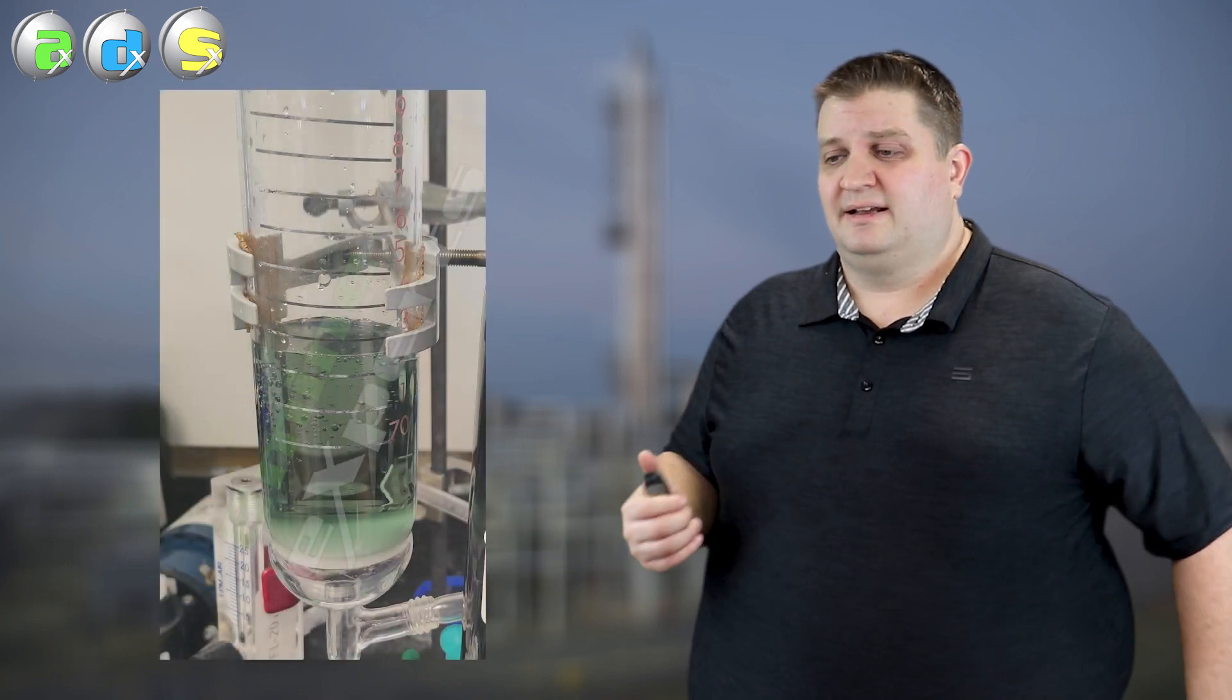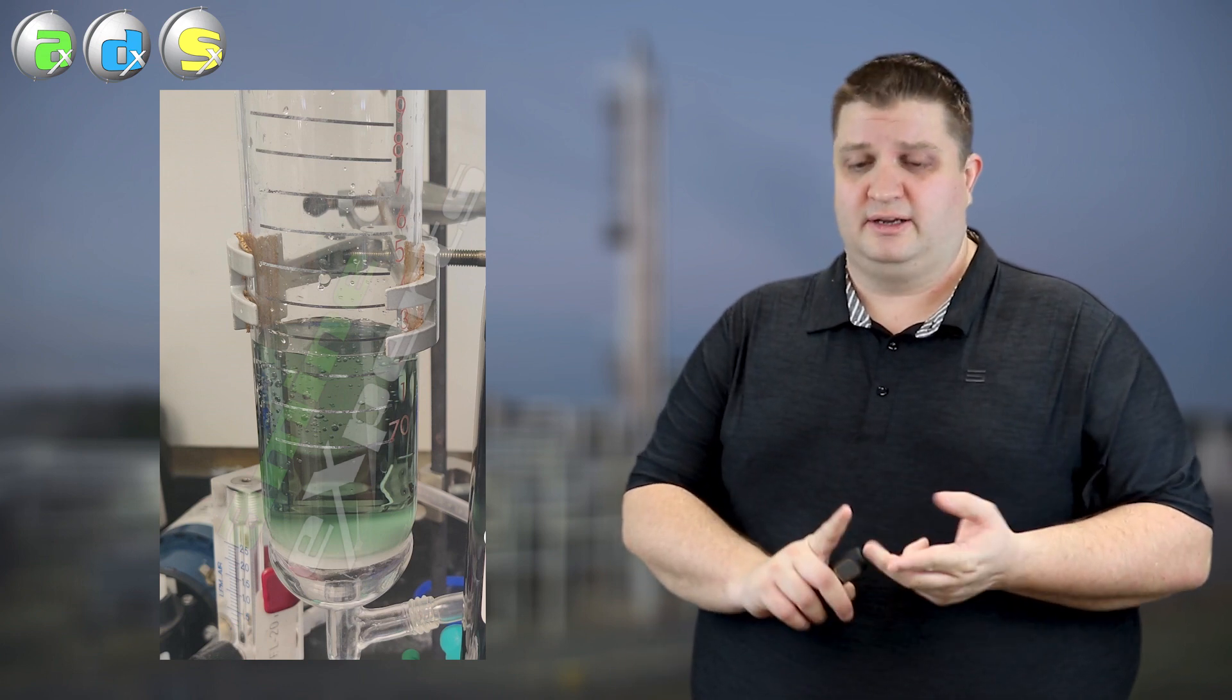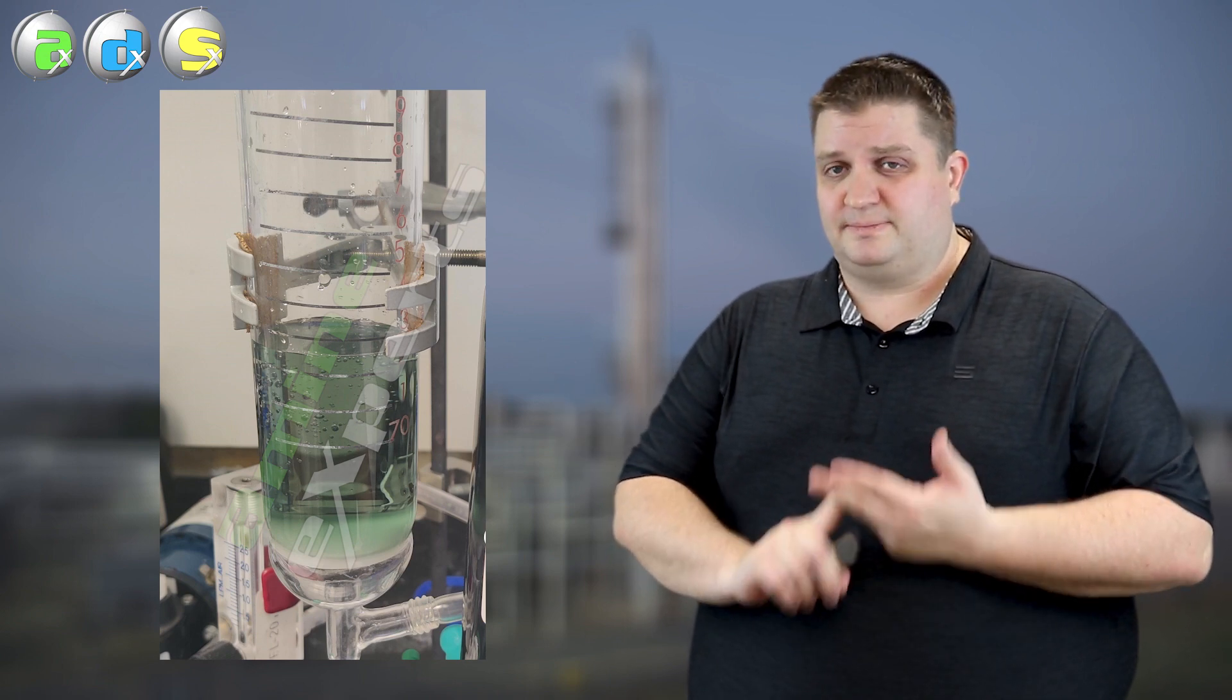Where things really become a problem is the next one here, a green amine. Once you get a green amine this is an indication that you have H2S corrosion going on within the system. So that's bad for two reasons. One, you have corrosion going on. Two, this is a lean loading sample. That H2S should all be gone, so it's showing you're not getting good regenerator performance right now.